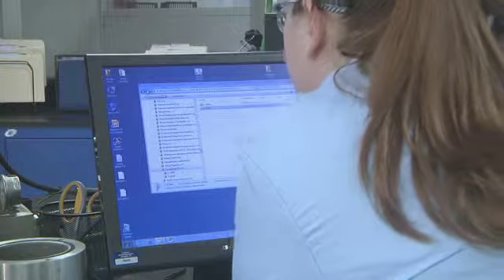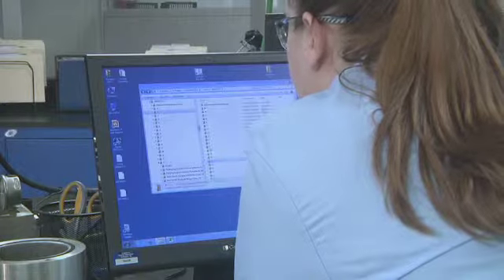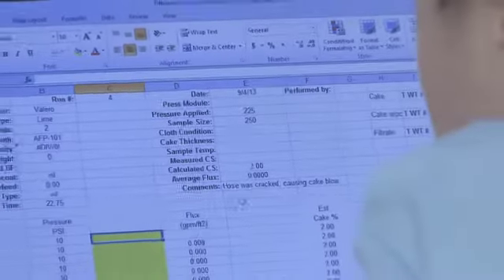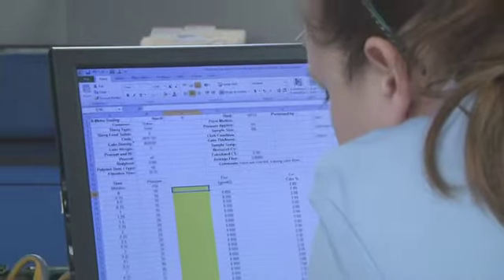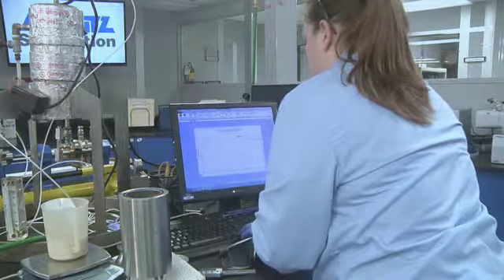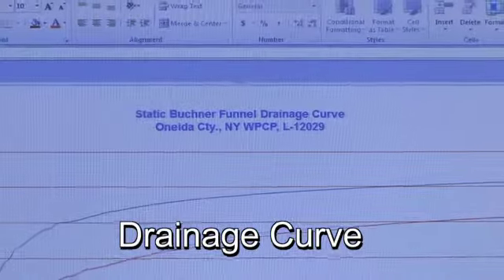When using a computer and spreadsheet for data collection, make sure data is being displayed correctly on the spreadsheet and new numbers are added down the columns. By repeating this process at different flow rates, it is possible to develop a curve showing the relationship between outlet solids concentration and flow rate.